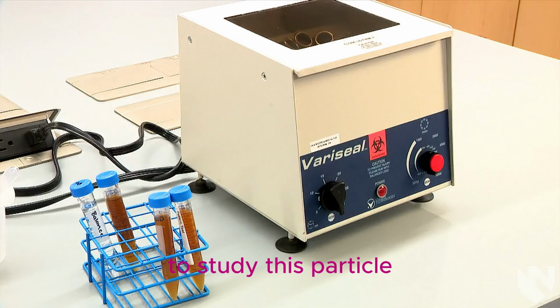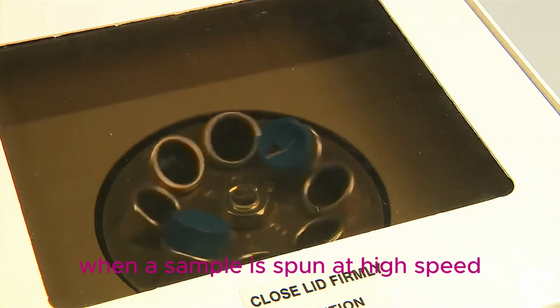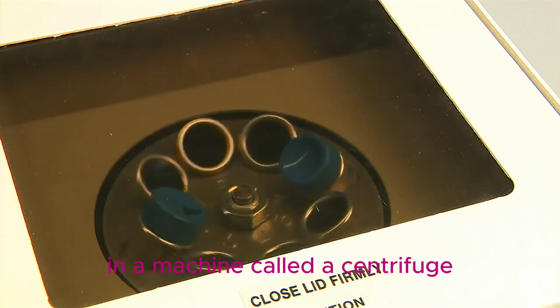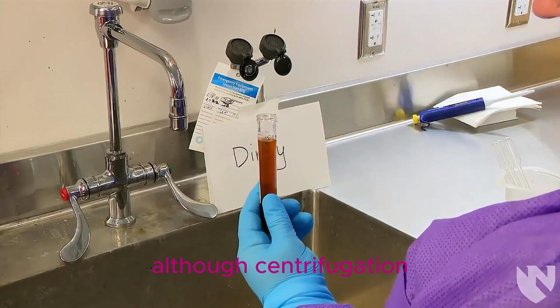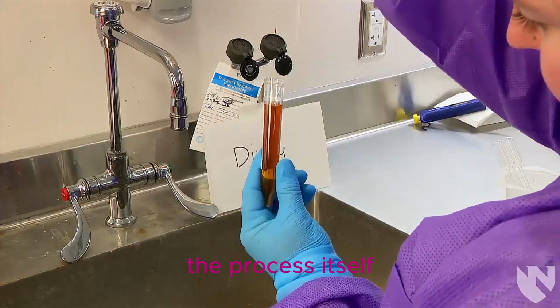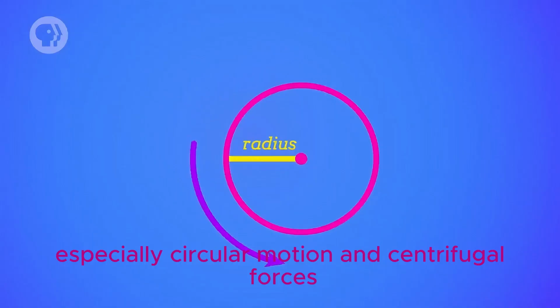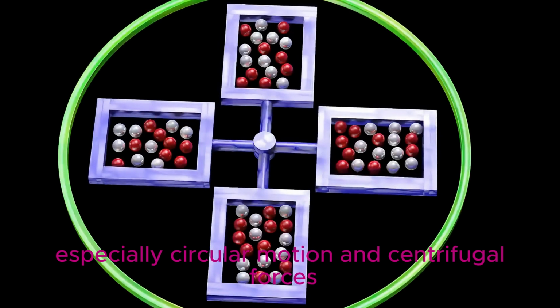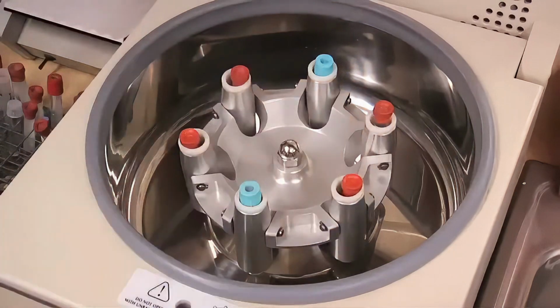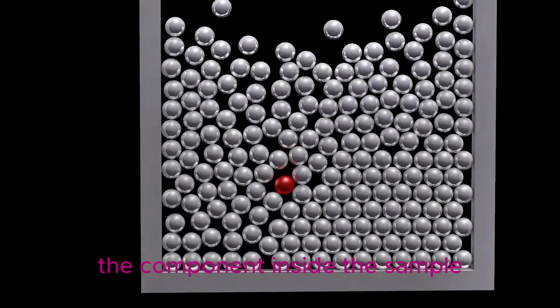To study these particles, scientists use a technique called centrifugation, where a sample is spun at high speed in a machine called a centrifuge. Although centrifugation is widely used in biology and medical laboratories, the process itself is mainly explained using physics principles, especially circular motion and centrifugal forces. In this video, I will explain how urine centrifugation works and how physics plays an important role in separating the components inside the sample.